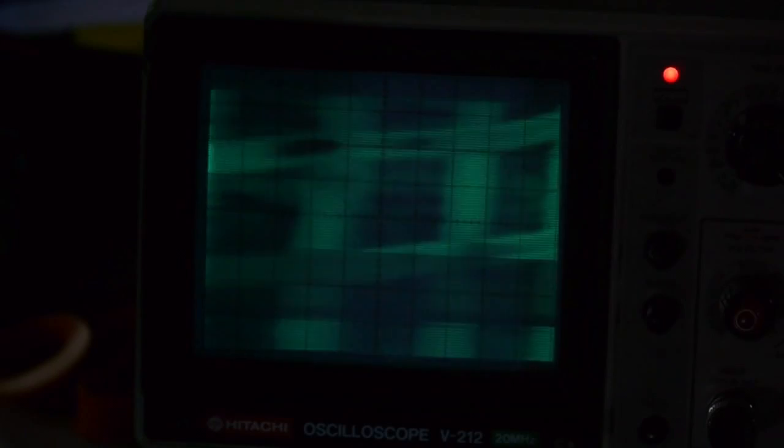As you can see it's getting near the resolution limit. We can kind of see some dark spots on the screen which indicates maybe some dirt like oil or something that's charging up. So those weird looking areas, even though the screen is all metal, if there's a film of oil on the screen and the oil becomes charged, that means that the electron emission from that area is going to be a little bit weird. There was that arc again as you can see it temporarily causes the image to disappear probably because the photo multiplier became saturated, but luckily it came back.